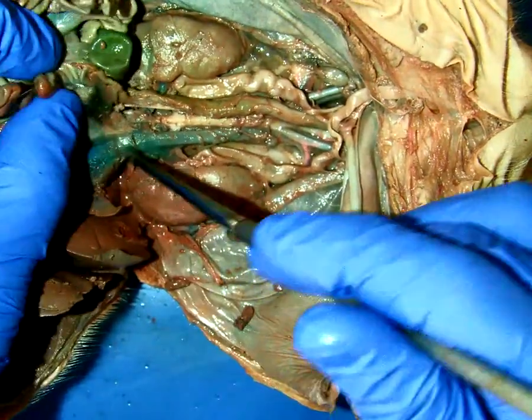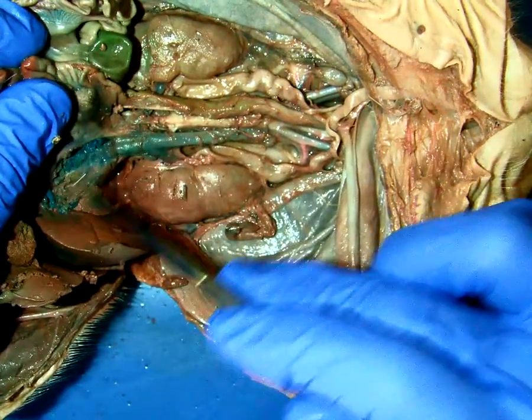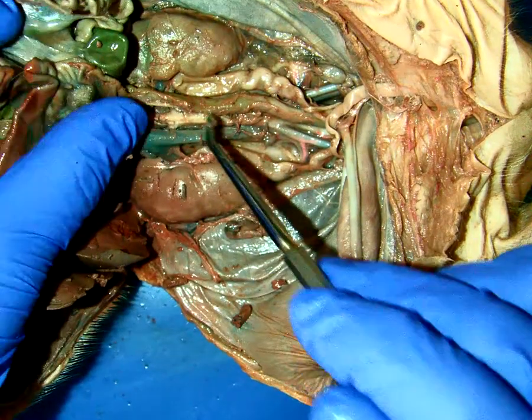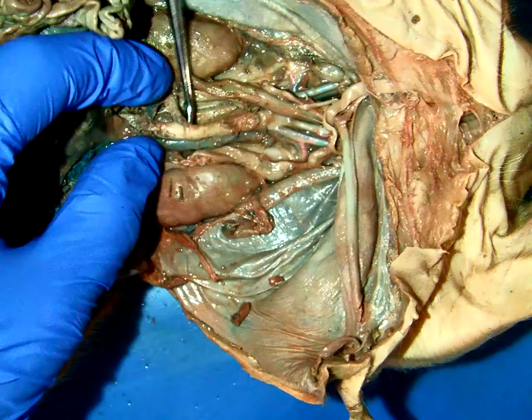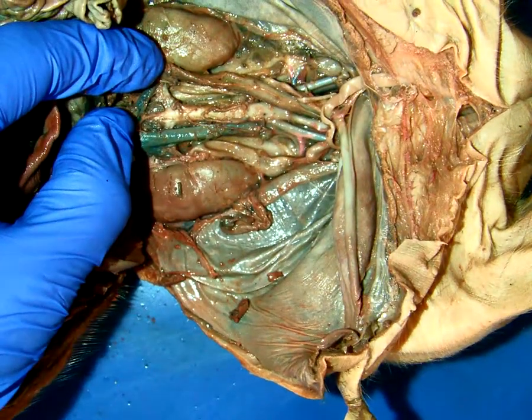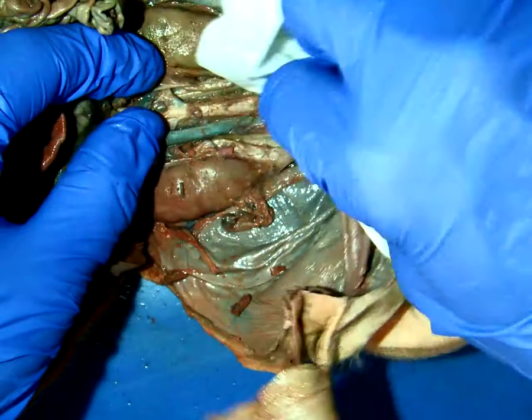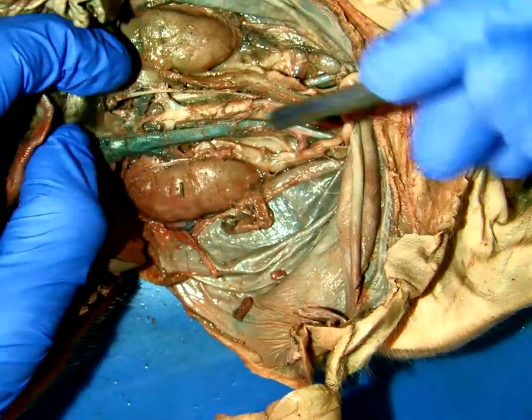And so what we see, again, a pretty good perfusion in the abdominal pelvic cavity. A little bit of a mess here, but the inferior vena cava is still real evident, right? And running next to it really nicely is the descending aorta, right? So it's coming down, and they will run together right along here. And we could probably take Kleenex or something and kind of, oh, there we go. I'm going to brush that aside, some of that connective tissue, right? And then there's all kinds of nerves and things.